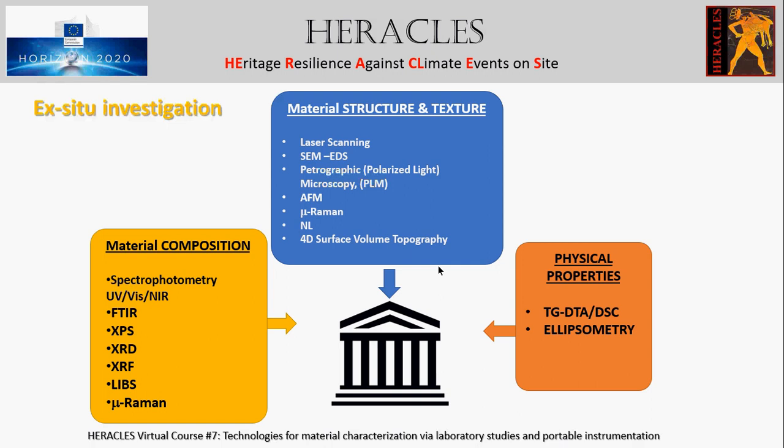The DSC application to binder mortars give information on the thermal power heat-producing rate produced by the hydration reactions. The timing and shape of the heat flow curve obtained by calorimetry is an indicator of relative performance of binders, mortars, and of potential adverse interactions between materials used in the mixture. Unfortunately, the sample recuperation in these cases is not possible.